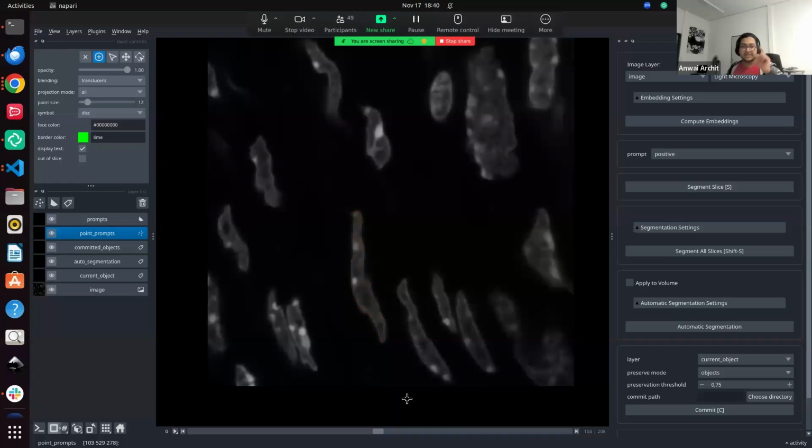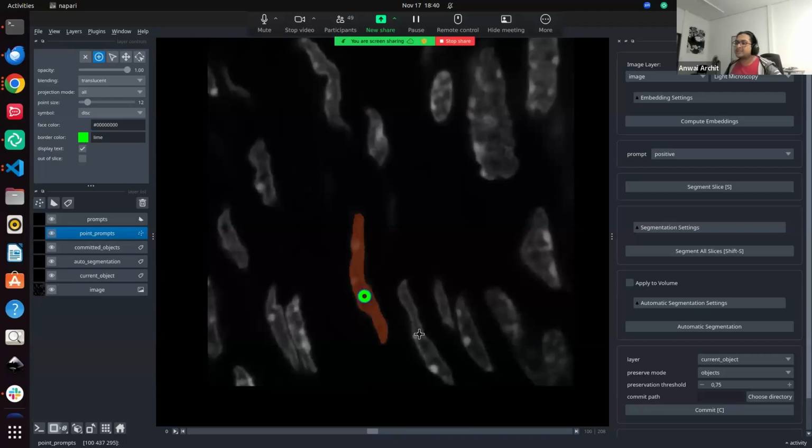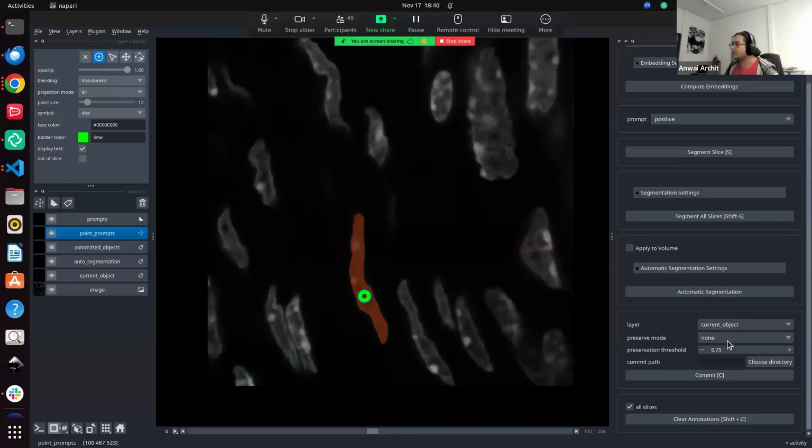And that could be a mess if I have to click every one of these. I can also show you, click this, click this, click this, but as you see, this is too messy. This could take a while, or you could easily interpolate throughout the slices if there's an assumption of the objects being isotropic, for example. But again, let's not go into details.